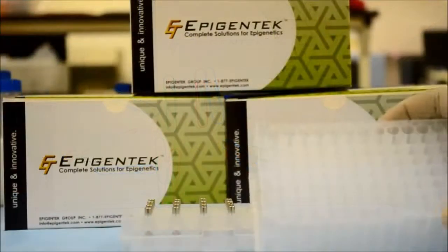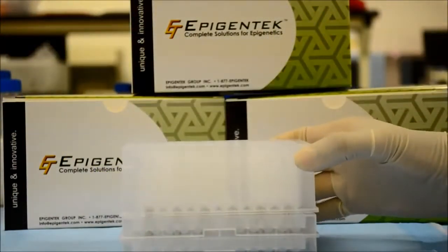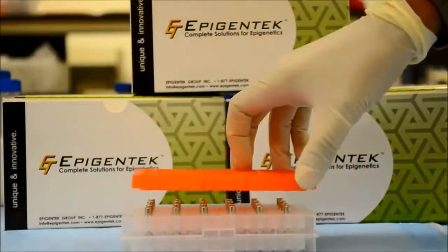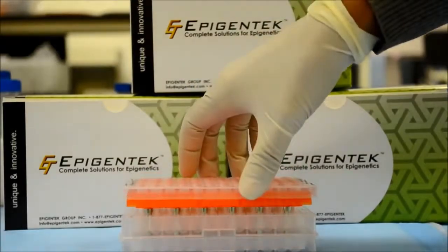Compatible with all standard microplates, the EpiMag also fits with 1-2ml deep well microplates. And with the use of the included adapter, the EpiMag works with various PCR plates.